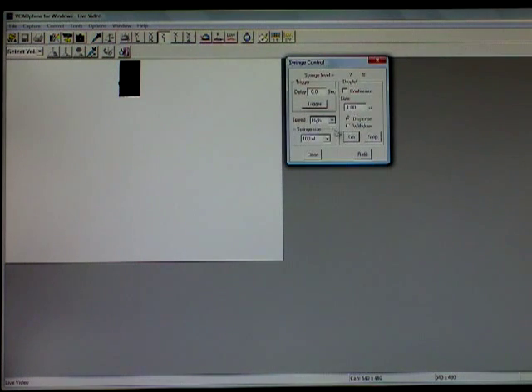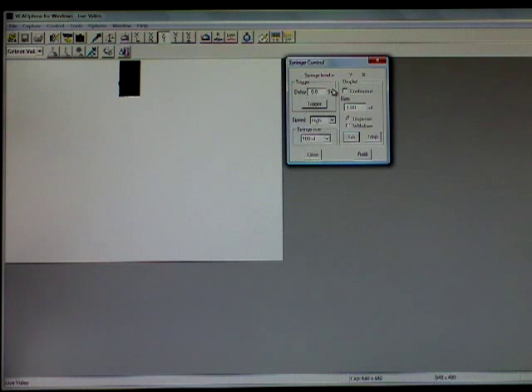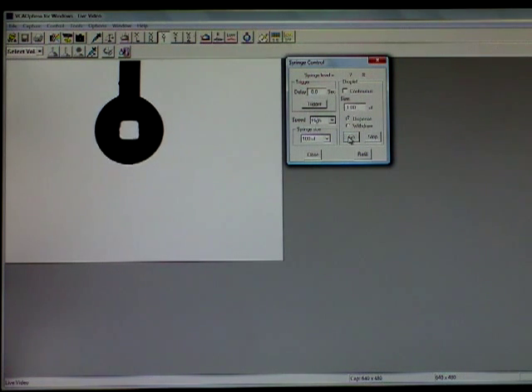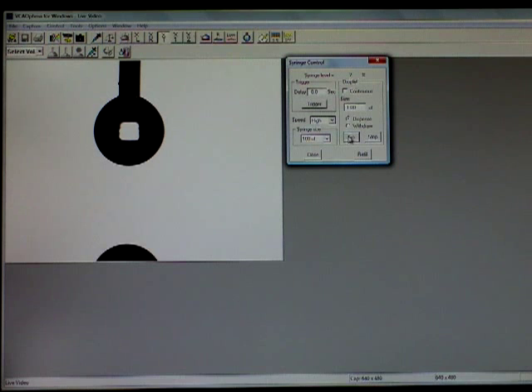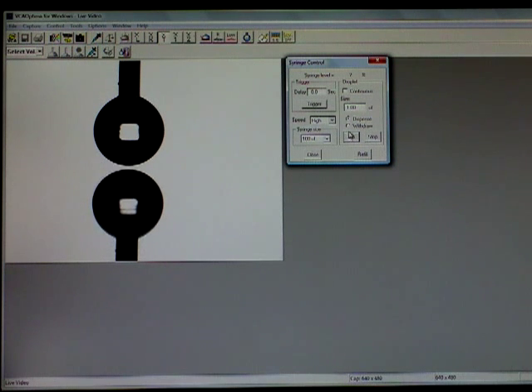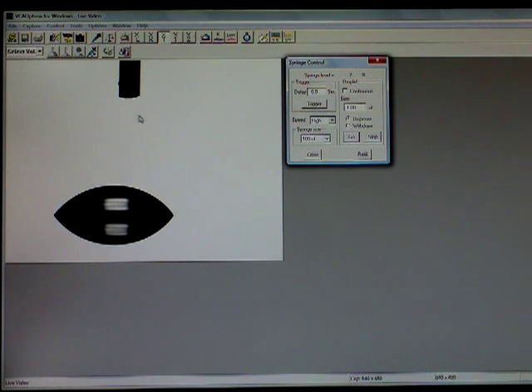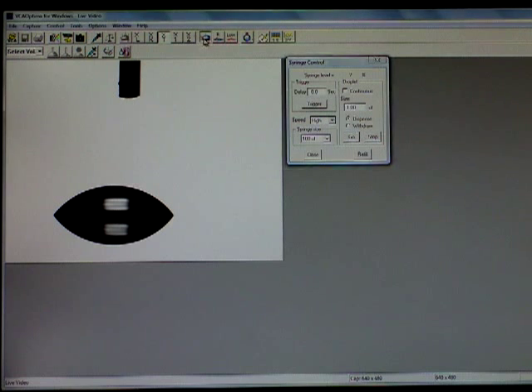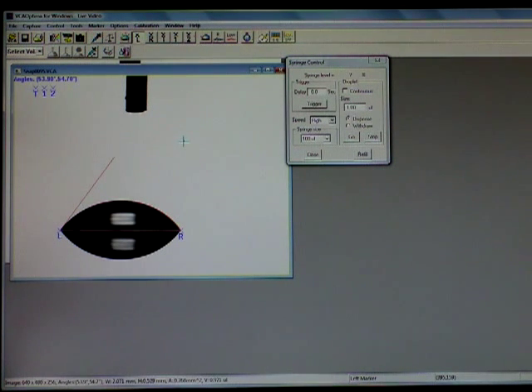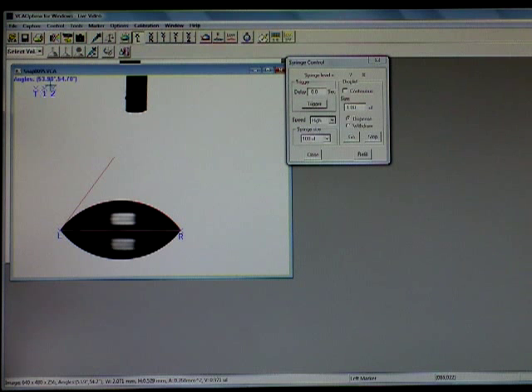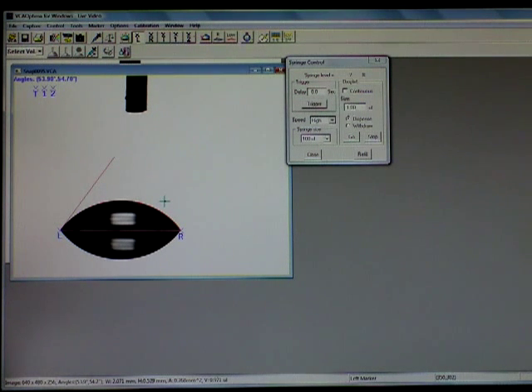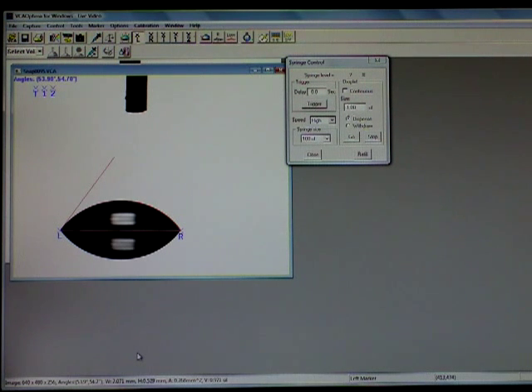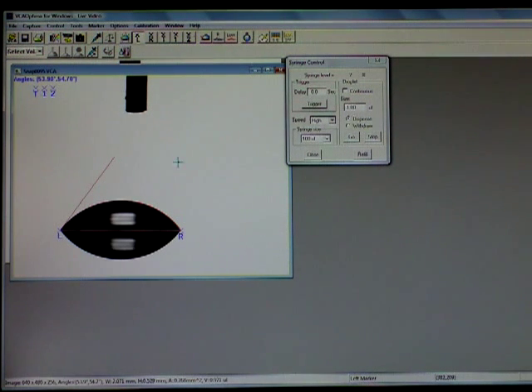Here is the syringe control. This controls the motorized syringe and I'm going to drop one microliter of DI water onto a surface, this being just the stage. I will pull the bubble away from the needle, hit the auto fast button and it measures the contact angle for you automatically. Right here it says 53.9 degree contact angle. At the bottom of the screen it also will show you the width, the height, the area and the volume which is also measured automatically.